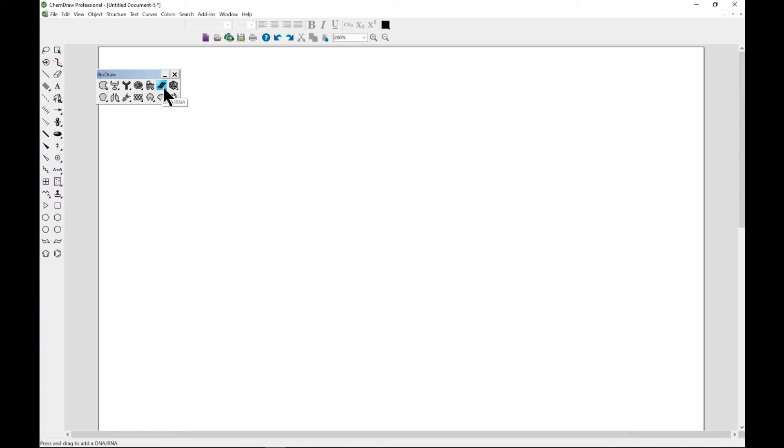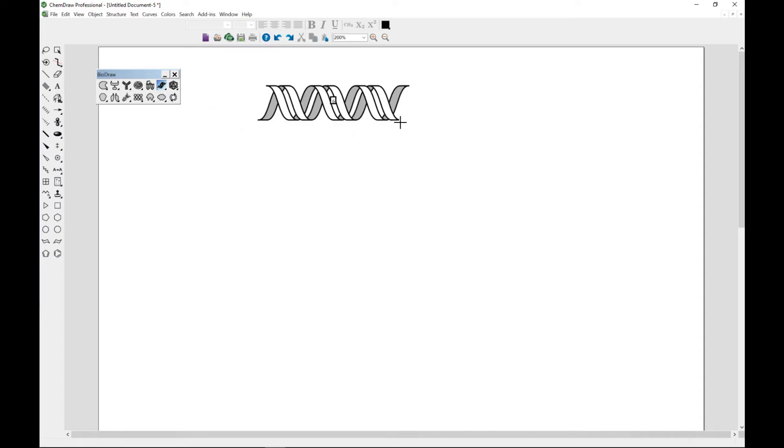one that people usually need, which is DNA. To create a DNA, you just have to select it and head over and draw it. There you go.